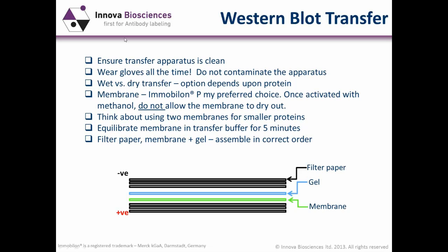And here we have an interesting option: whether you opt for the wet versus the dry transfer. This depends on the protein of choice. I refer back to my 170 kilodalton protein, which I spent a lot of time struggling with. In the end, if I used a quick dry transfer system, I had no success whatsoever.